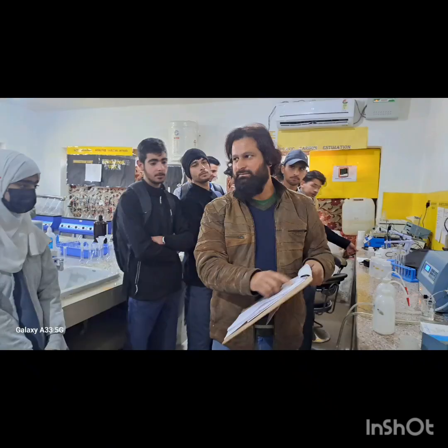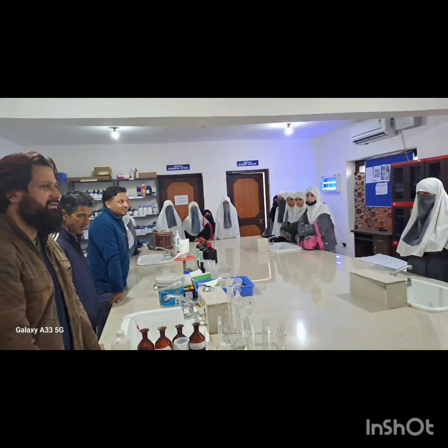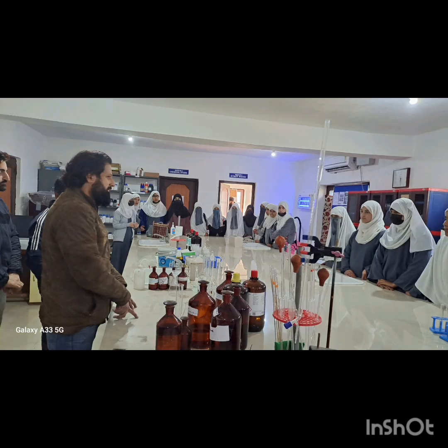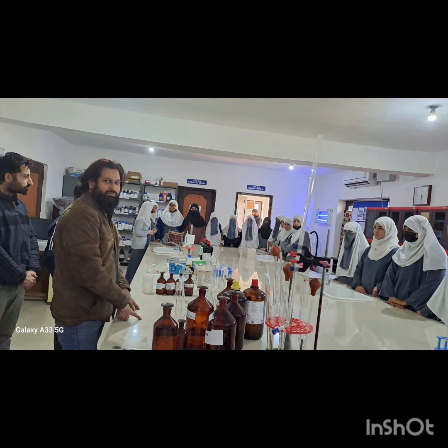7. Conclusion. The visit to the soil testing laboratory was a successful educational trip that broadened the students' knowledge of soil science and its applications in real-world agriculture. High School Qazipora thanks Dr. Inam and the STL team for their support and dedication to fostering agricultural awareness among young students.